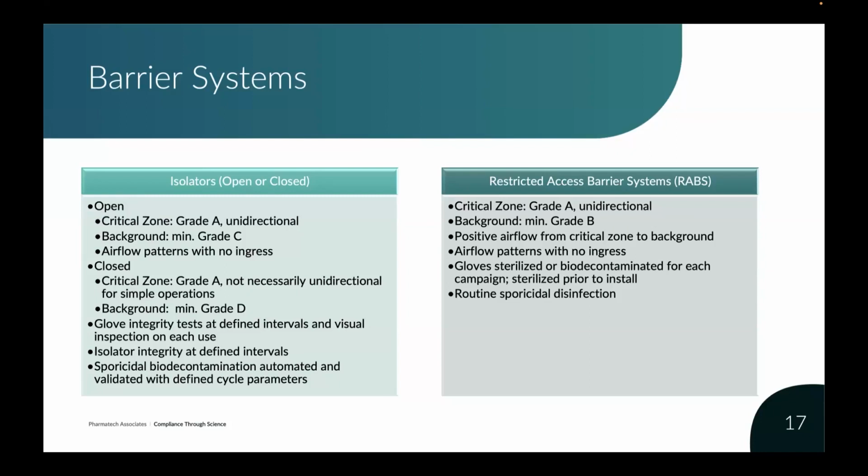If you have gloves on the RAB system, they must be sterilized or decontaminated for each campaign and sterilized prior to installation. And there should be a routine sporicidal disinfection, but it's not required to be automated for a RAB system.